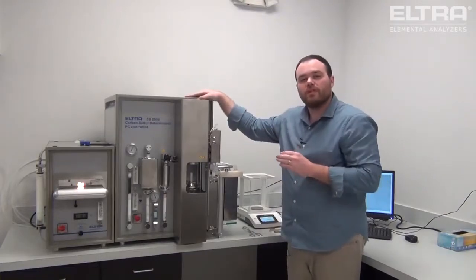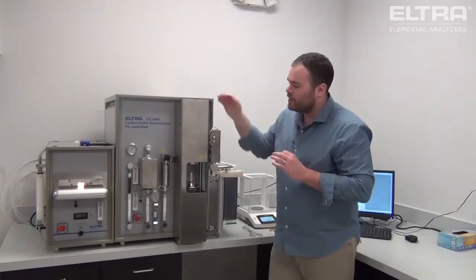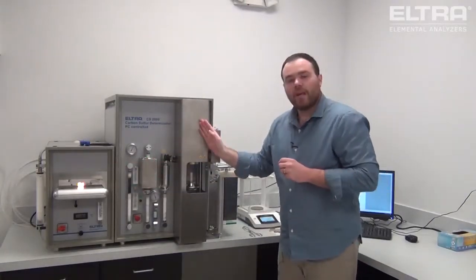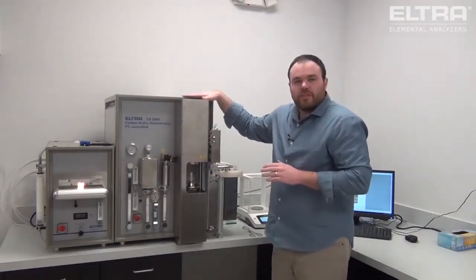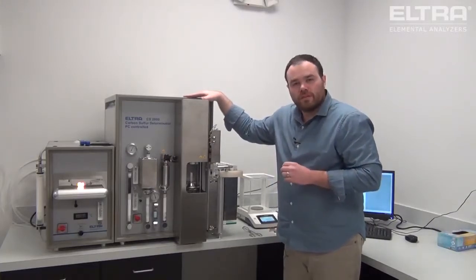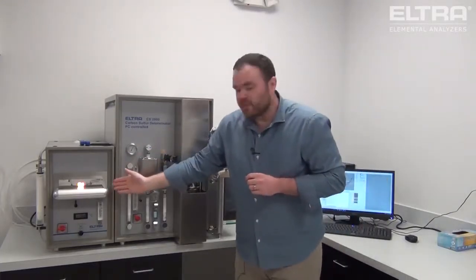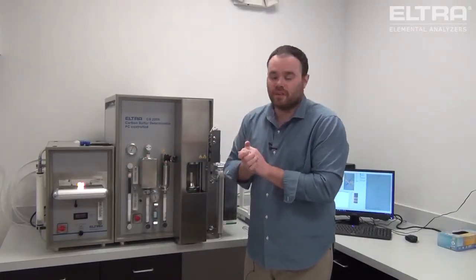The CS-2000 is identical to the CS-800 with the addition of the resistance furnace, which gives us the capability of running inorganic and organic samples. The induction furnace here is capable of temperatures greater than 2,000 degrees Celsius, and the resistance furnace is capable of temperatures of up to 1550 degrees Celsius.